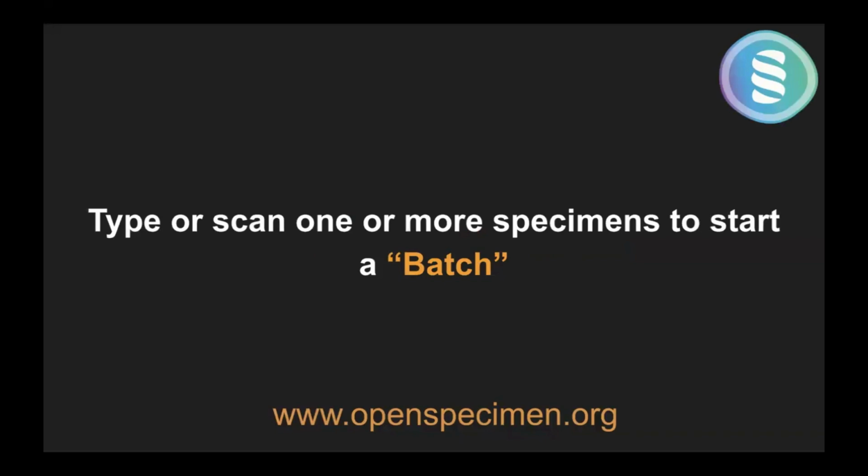To start the workflow, since most of them are specimen processing workflows, you typically start with the specimen barcode. But at the same time, it could also be, like I just said, a participant's PPID or a visit label, especially for sites which have kits. The visit name is the kit barcode. So now you can just scan the kits. When you receive the kits from the site, all you need to do is scan the kit. It will pull all the specimens within the kit, and then you can start the workflow for the whole kit. Like when you're receiving the kit, you need to mark all the specimens in the kit as received. So you just scan the kit barcode and then continue with the rest of the barcodes.